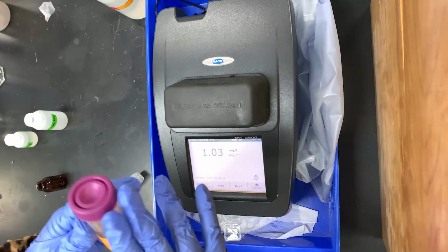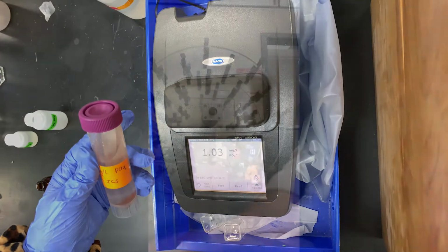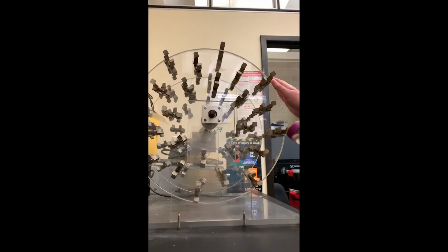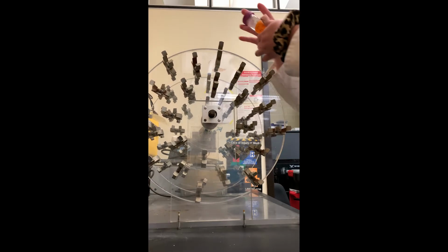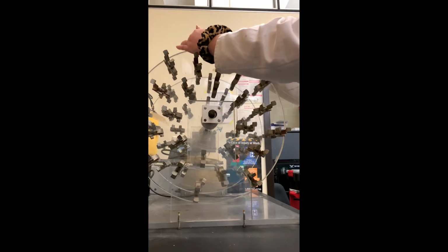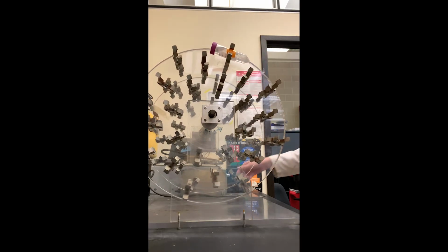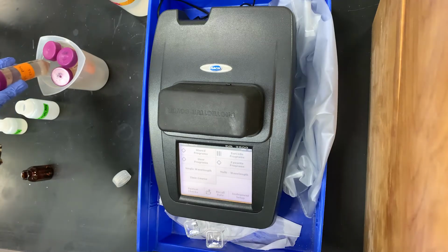There is 1 gram of iron-coated sand pre-weighed that I've just poured into the centrifuge tube with the rest of our 1 milligram per liter standard. This is the rotator here, and what you do is take your centrifuge tube, clip it into one of these clips right here, and turn it on, and it mixes on its own. I'll leave these for 24 hours to mix, and I'll come back and finish this tomorrow.